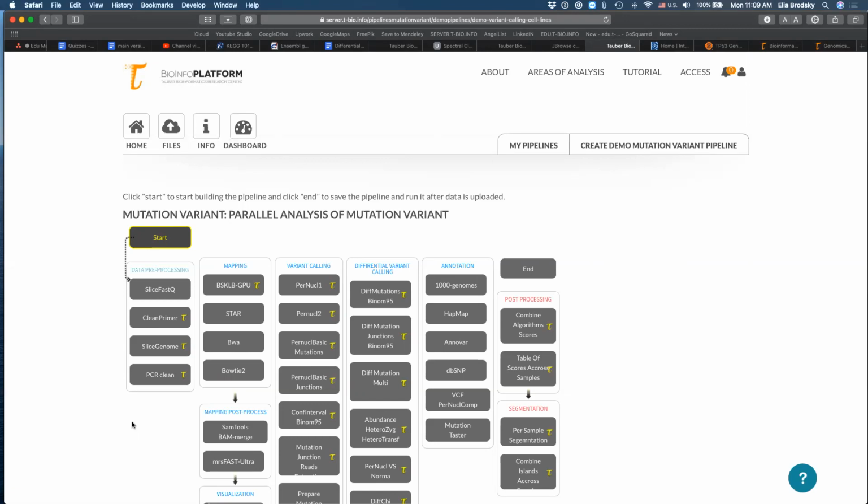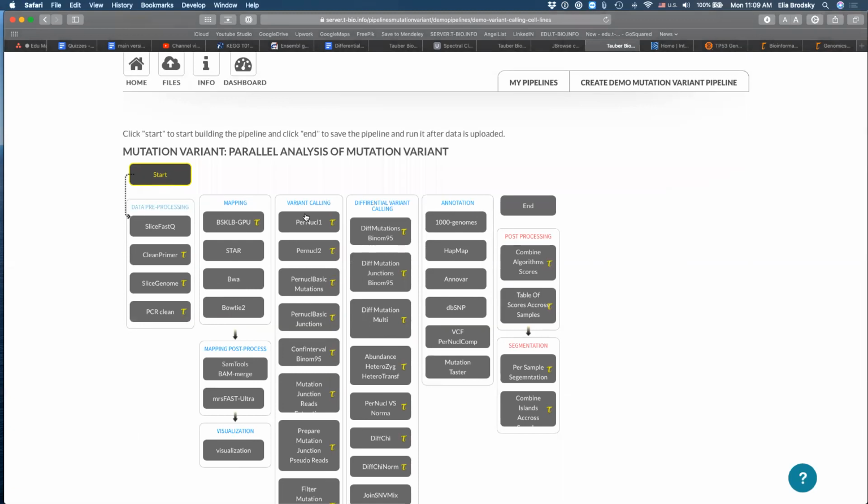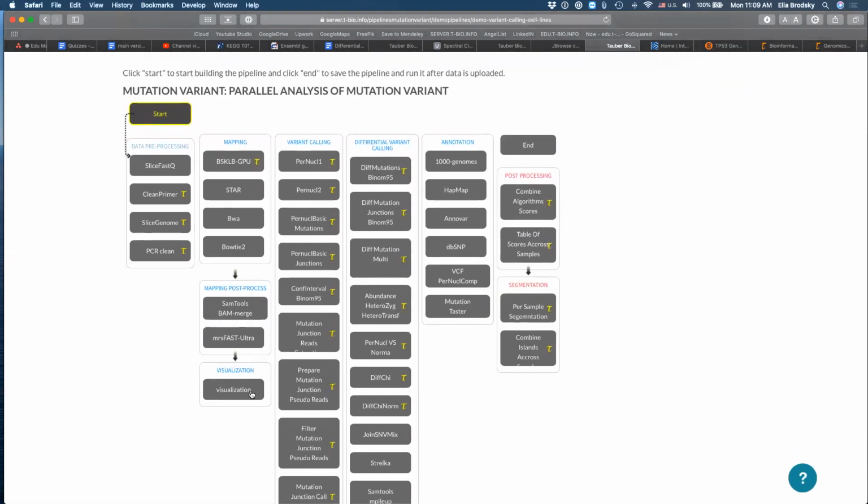And so we can make sure that we are selecting only the reads that are of high quality by using this pre-processing step. Then the first pipeline that we will do is actually we will map those processed reads onto the reference genome and visualize them. And that will give us a sense of what is in the data, right? So let's go ahead and do that.